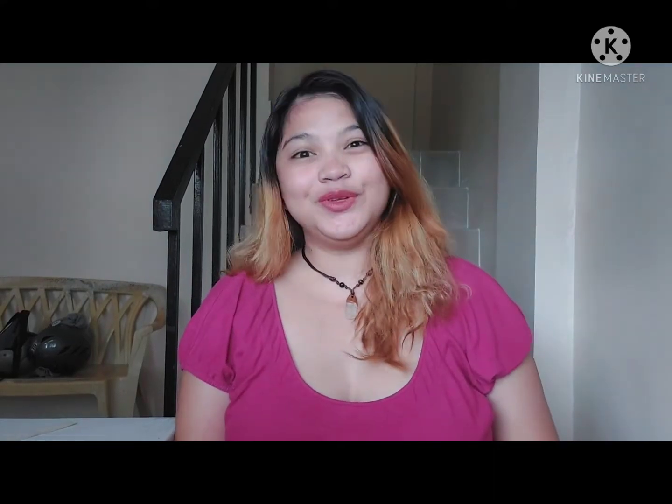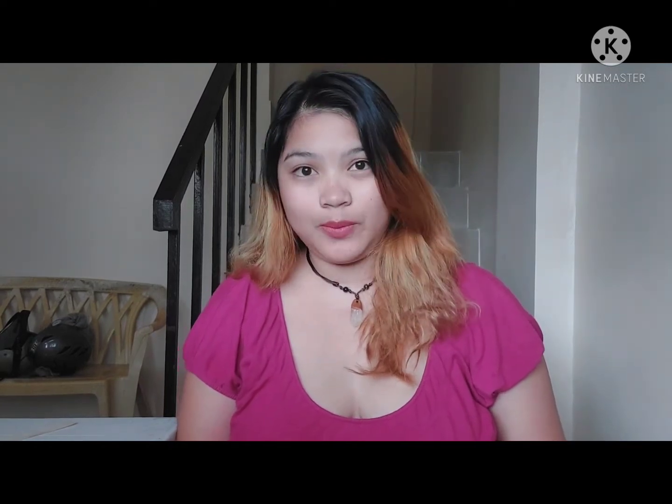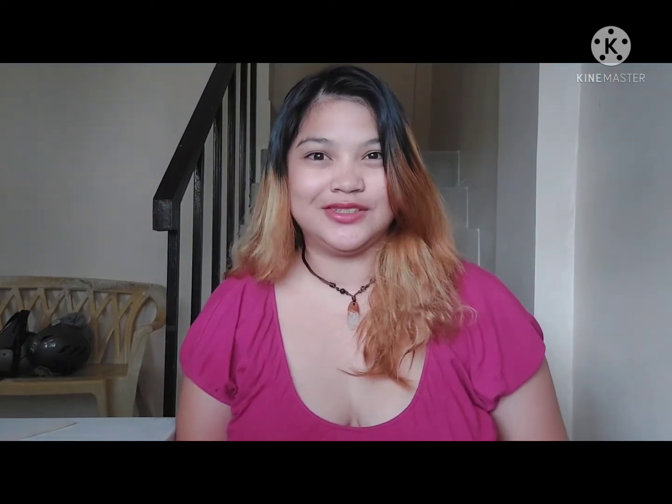Hello everyone, good morning. So we already do know that a mixture is a combination of two or more substances or compounds. For today, I am going to show you some examples on how to separate this mixture.